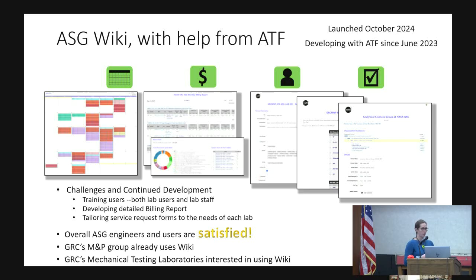We also have been working on our billing reporting. So this is just kind of a little picture we have based on each account, the number of hours that were booked, and the users. So all of that data is accounted for, and then we can send bills and say, hey, you used our stuff, now you owe us money.